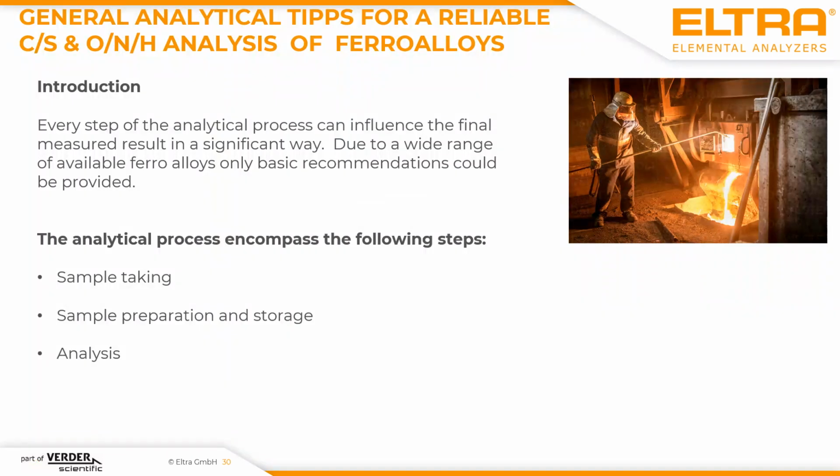A reliable carbon-sulfur or oxygen, nitrogen, and hydrogen analysis always means that you not only have to take care of the analyzer and its settings, but you also always have to consider the sample taking, sample preparation, and sample storage. In the following, I will show you which effect an error in one step could have.